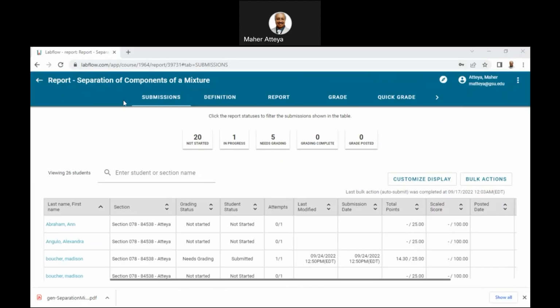And out of this, we need to show where that really is. Shape, our arrows again. This time make it red, and then here is blue. So here it is, report.